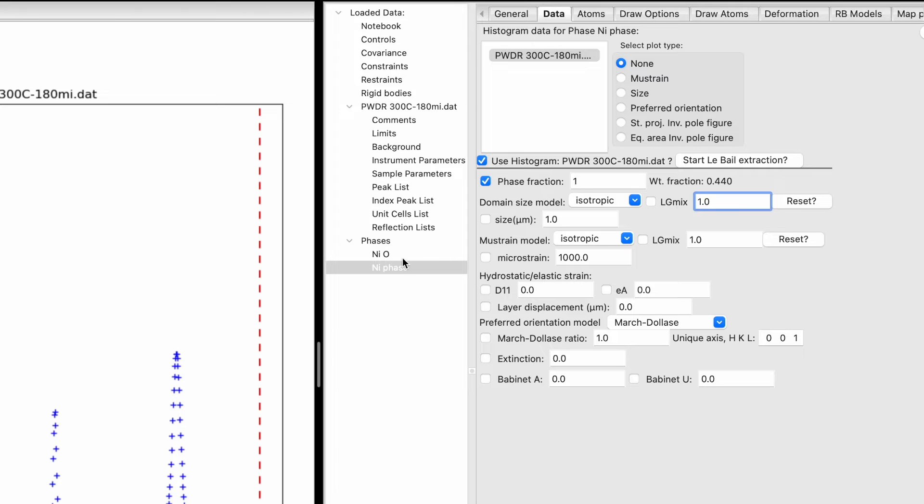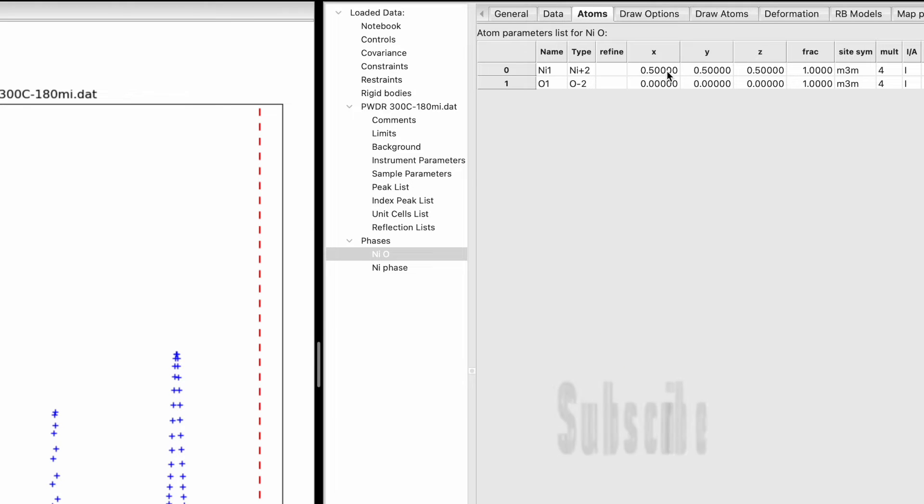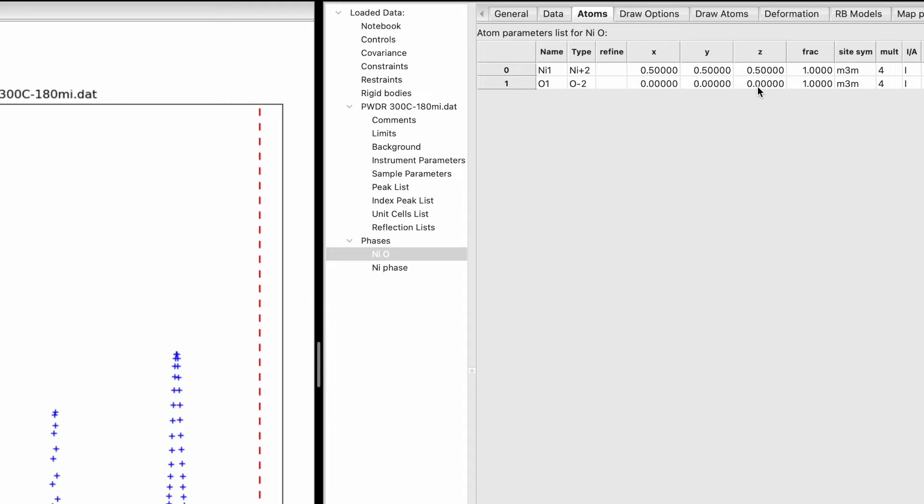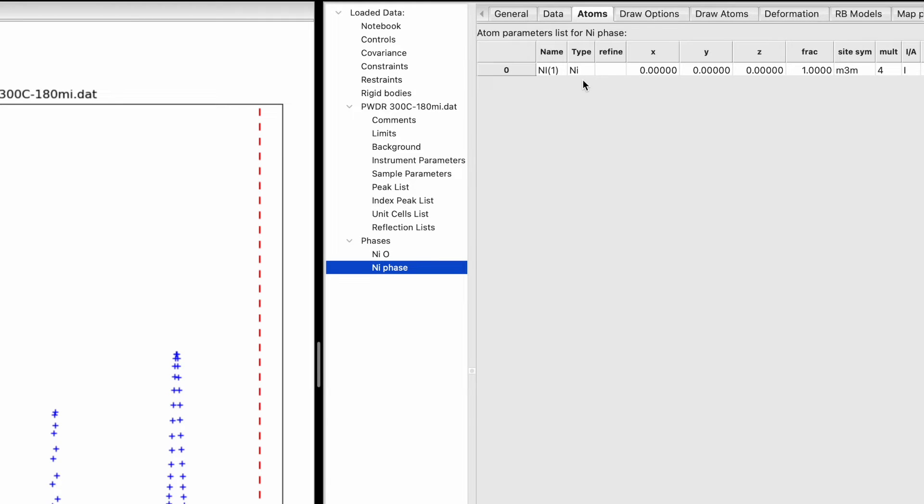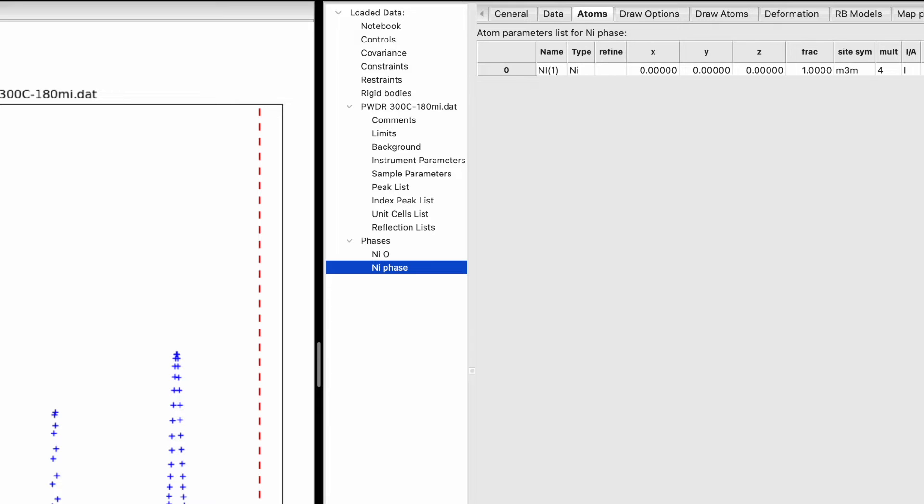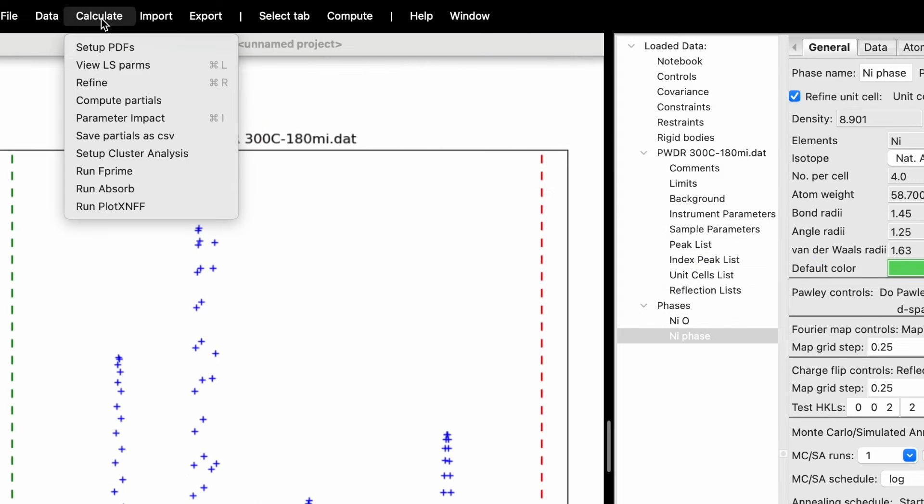Click on Atoms for nickel oxide. There are two atoms: nickel at coordinates 0.5, 0.5, 0.5 and oxygen at 0, 0, 0. These coordinates are fixed, but we can refine the fraction and thermal parameter Ui. For nickel metal, the Cartesian coordinate is 0, 0, 0 with fraction 1. We can refine the thermal parameter.